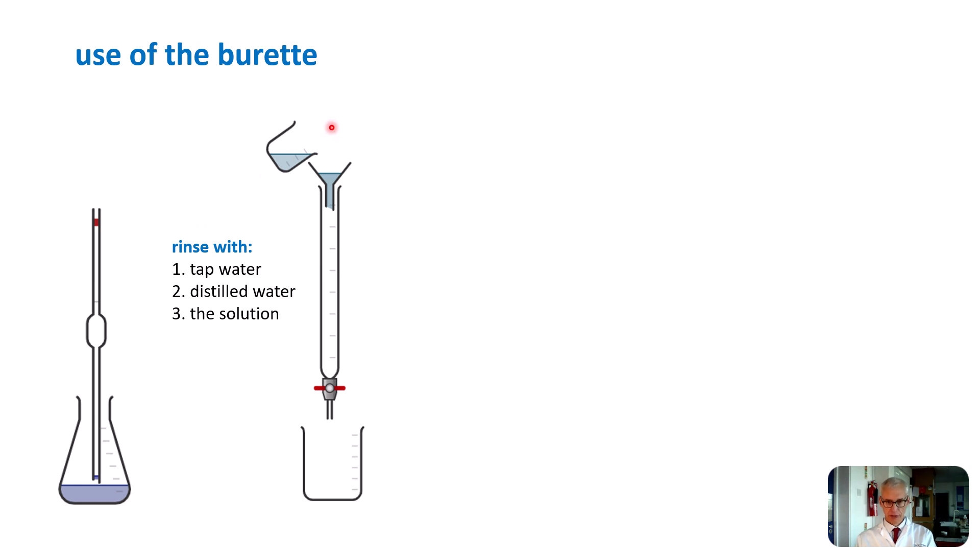We fill the burette from a beaker with the solution of unknown concentration. Of course, we need to make sure that the tap of the burette is closed, which is in the position as indicated. We also note that we have a beaker underneath the burette. We do not place the conical flask under the burette at this point because there may be spillage. You often, when you're inexperienced, overfill the funnel and then you have a solution running down the burette. We don't want that going into the conical flask of our test solution. So, a beaker to catch any overflow.